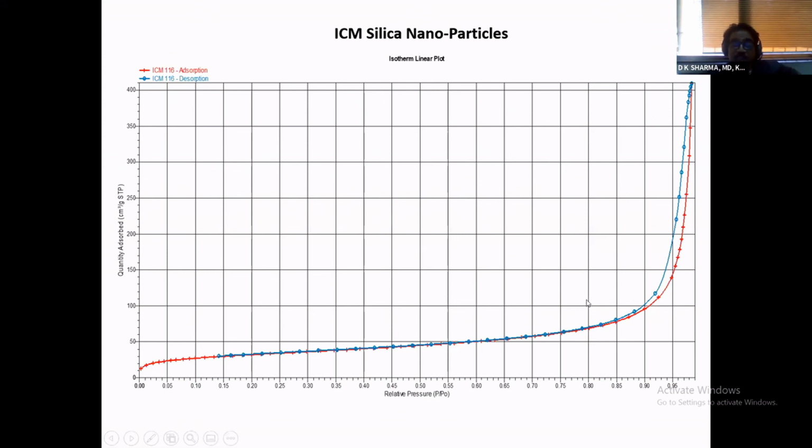Be careful, because otherwise you will almost always end up in a situation that my nanoparticles are 500 angstrom porous. That will be the result you will be presenting, and God forbid if in the same paper you also publish what the particle size is.